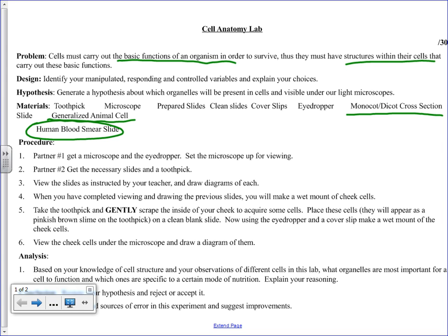Now, here's the thing about the cheek cells. They're not stained, so they are not going to be colored like the rest of the cells you looked at. So it's a little more difficult to get them focused because they're transparent. The way to get them focused and make them stand out is to alter the kind of light that is coming in. Underneath the stage was that condenser diaphragm, that tab I showed you the last time. You want to close that off so that it gets kind of dark. As it gets darker, the cells will simply jump out, not literally jump off the slide, but they'll jump out appearance-wise. They'll look almost three-dimensional, and they'll be very, very clear.